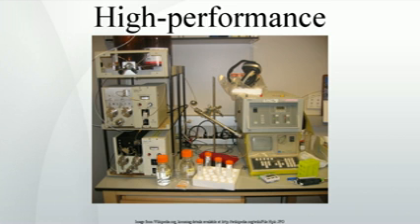In elution mode, substances typically emerge from a column in narrow, Gaussian peaks. Wide separation of peaks, preferably to baseline, is desired in order to achieve maximum purification. The speed at which any component of a mixture travels down the column in elution mode depends on many factors. But for two substances to travel at different speeds, and thereby be resolved, there must be substantial differences in some interaction between the biomolecules and the chromatography matrix. Operating parameters are adjusted to maximize the effect of this difference.